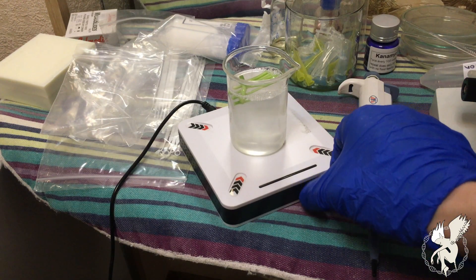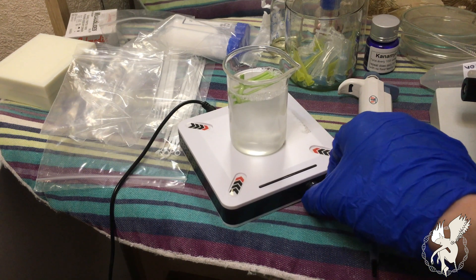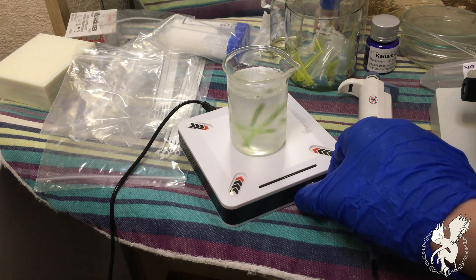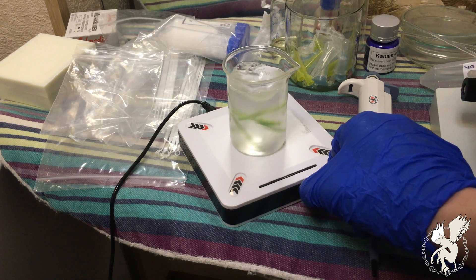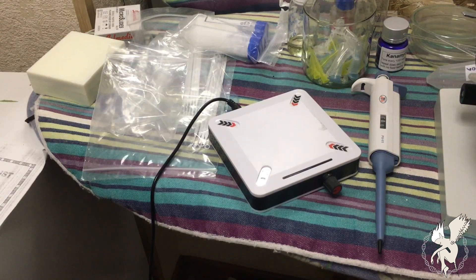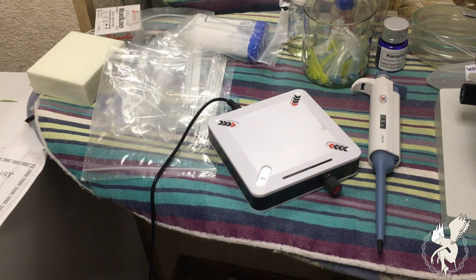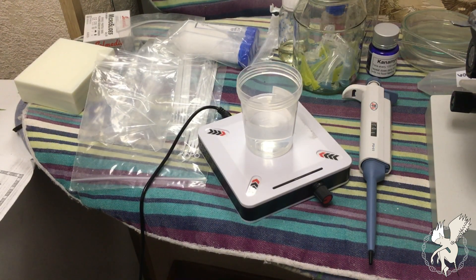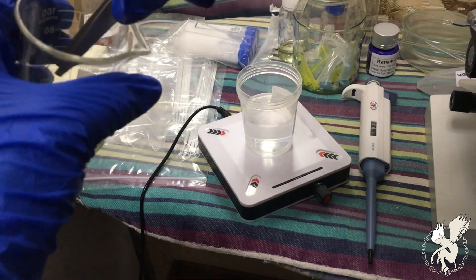Now put the explant into a 1% solution of bleach for 30 minutes in order to kill off every microbe, bacteria, or fungi around the plant. After 30 minutes, transfer your explants into an ethyl alcohol solution and let them sit there for five minutes for further sterilization.